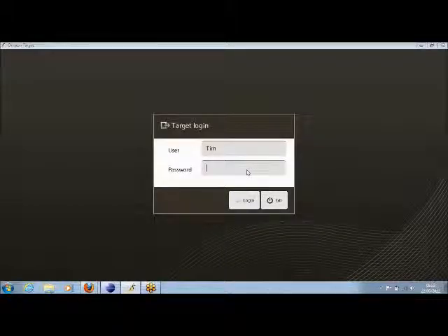Okay, so hello everybody. This is a demonstration for Omixon Target. It's going to be a short demonstration, 15 to 20 minutes, and I'm going to introduce a few of the features of Omixon Target and show one or two of the concepts behind the tool, and also talk a bit about why we've built it.